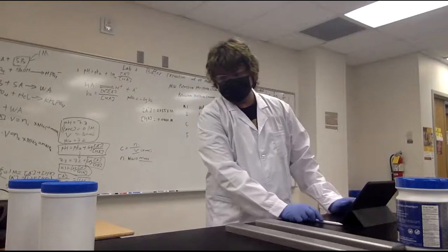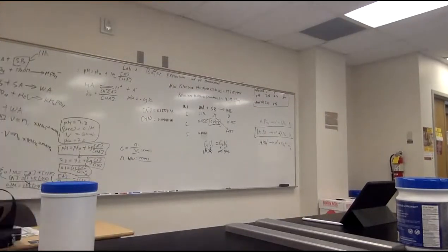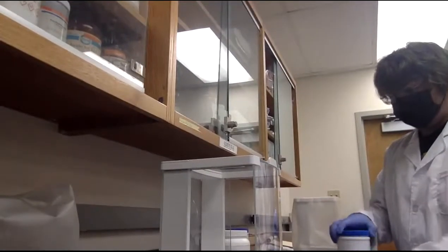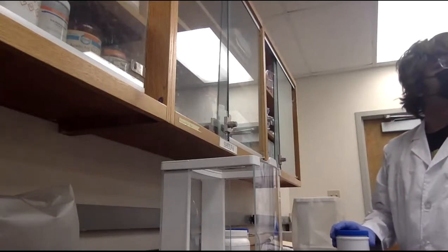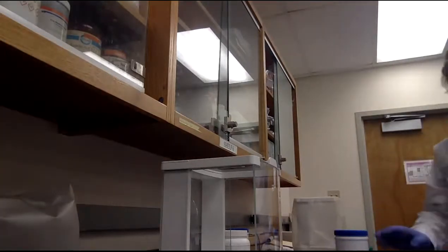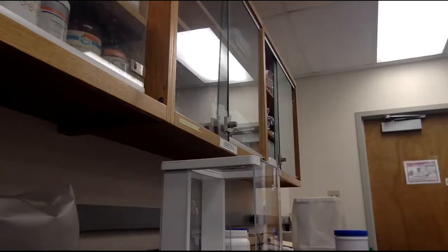Basic one, I believe. Yes. You just weigh this on the weigh boat, and you grab 3 beakers from the rack. This is where you make the buffer, in the beaker. Yes. And do I need to do anything in the fume hood? No, that's fine.